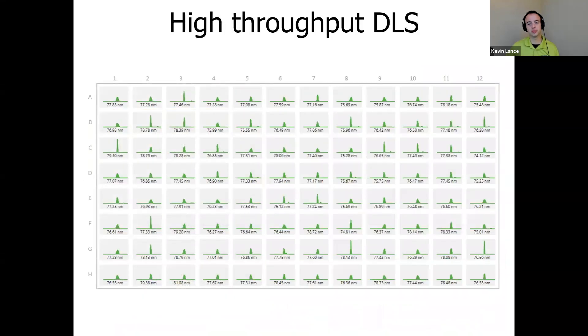Stunner's DLS gives you that high-throughput power to gather size and size distribution on 96 samples in less than one hour. Here we're looking at intensity distribution data for a whole plate of LNPs, with the average diameter noted below each distribution. So you no longer have to be limited by DLS data that has to be manually gathered for about a dozen pieces of data in a day max. Now DLS can keep up with the LNP samples that you're generating as fast as you can make them. Also important is that while this whole plate is run in less than an hour, the actual time to load a plate is no longer than the time it takes to load a plate, a couple of minutes.